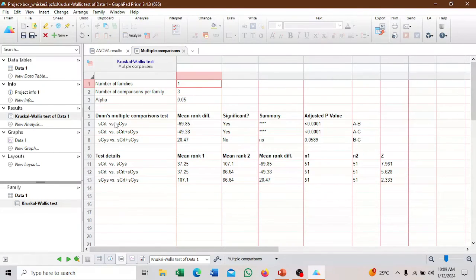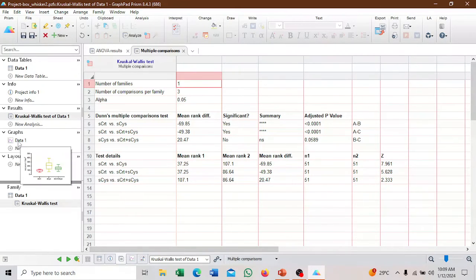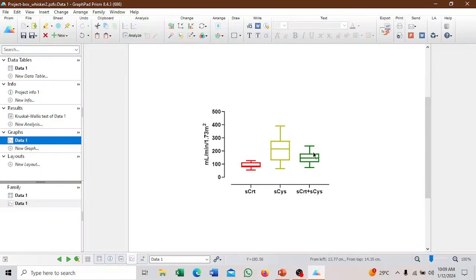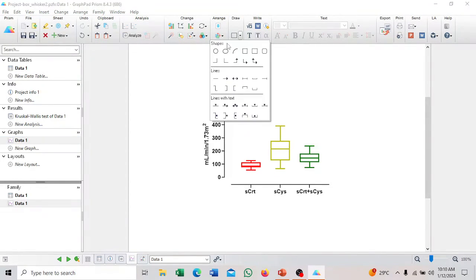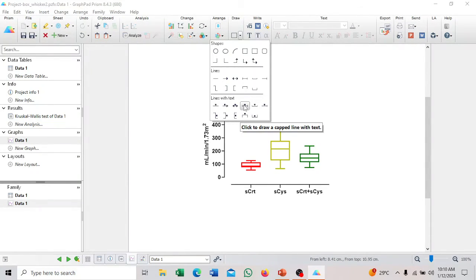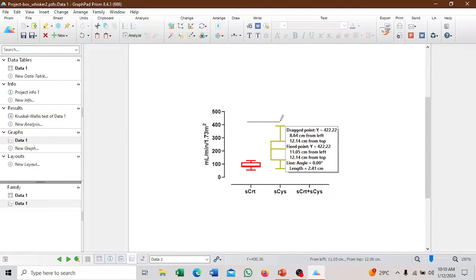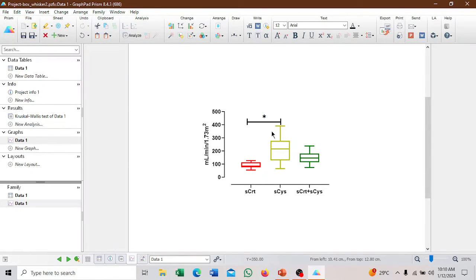Our differences lie in the first two. We have to come to our figure. You can see that the P values are the same. You can just use a single symbol to represent that and then define them. The difference between the red and the gold and then the red and the green, but there's no difference between the gold and the green. There are various lines here. We'll choose this one. You hold down the right key and then drag between the first and second. We can use one star since the P value is the same.